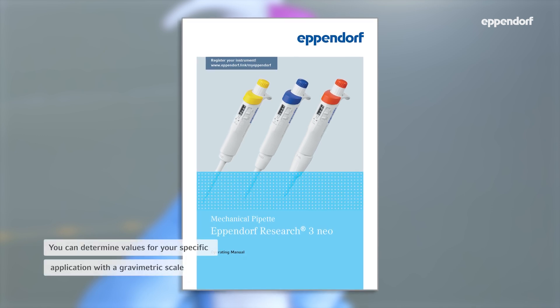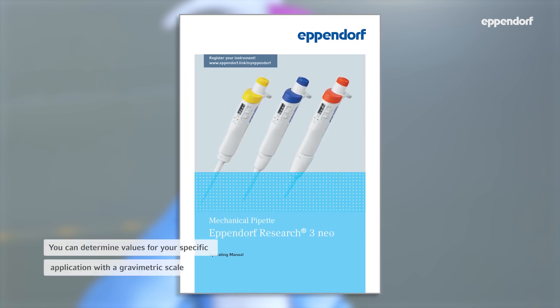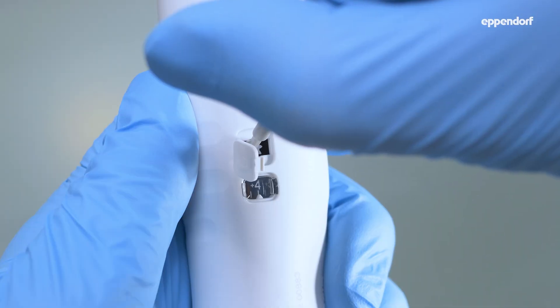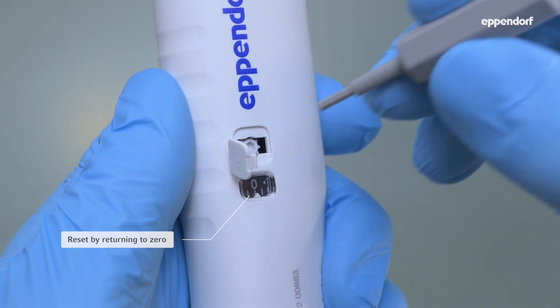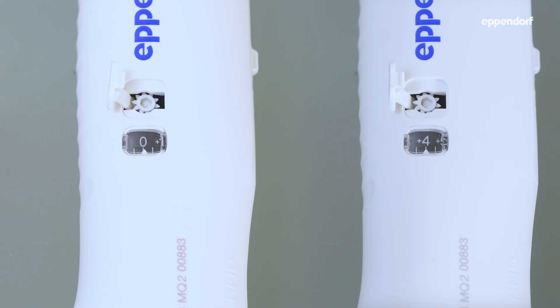With a gravimetric scale, you can determine values for your specific application at any time. To reset the temporary adjustment and return to the last calibration, simply turn the scale back to zero.